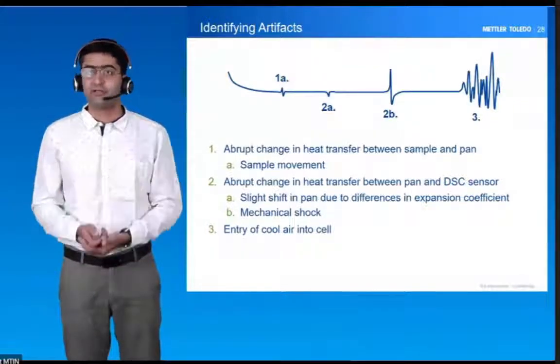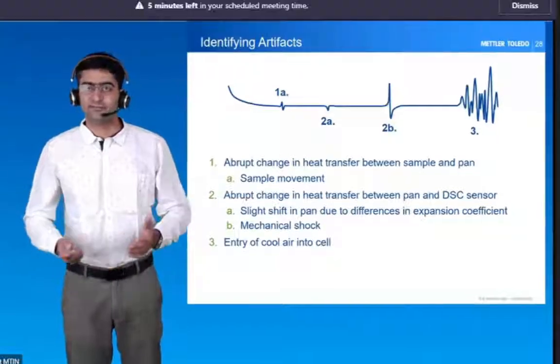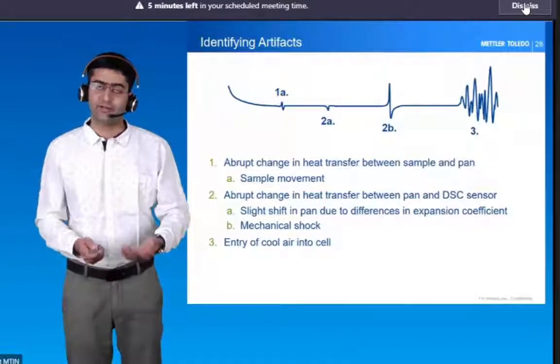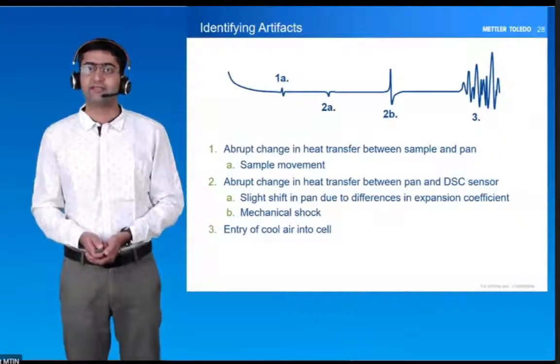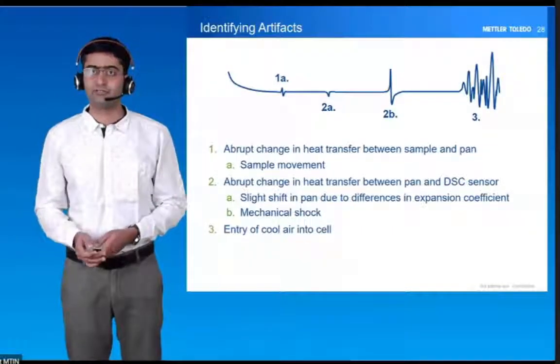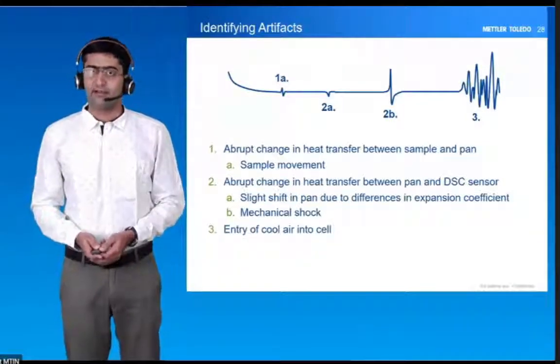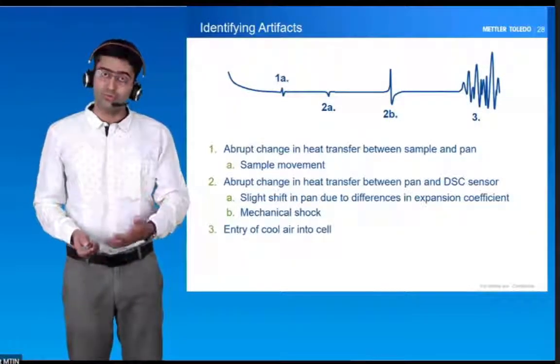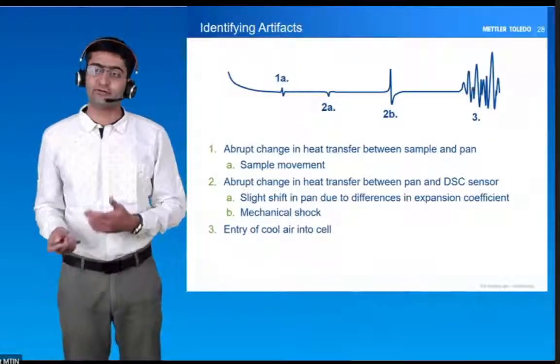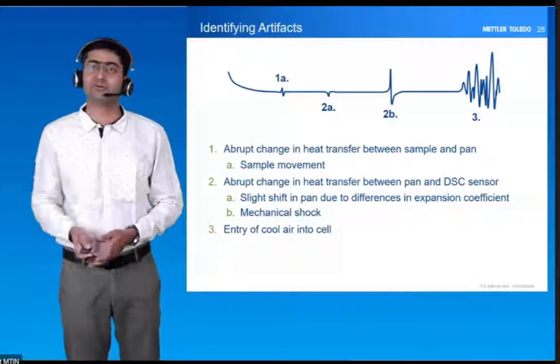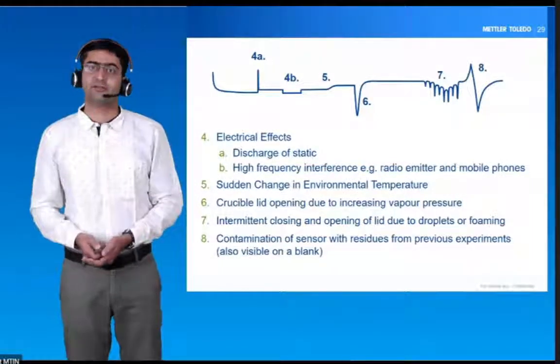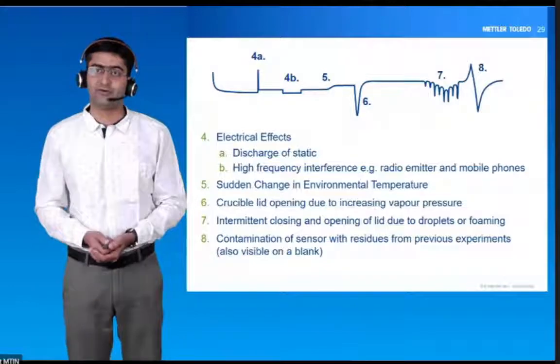If there is a mismatch in the expansion coefficient of your sensor and your pan, you will have this kind of artifact. Then, mechanical shock — if the table was moved or some sudden impact occurred — will also cause artifacts. Entry of cool air will also cause artifacts, which is why it is recommended that your DSC should not be in front of a door or just below your air conditioner. A discharge of static charge or high-frequency interference will also give you this kind of artifact.